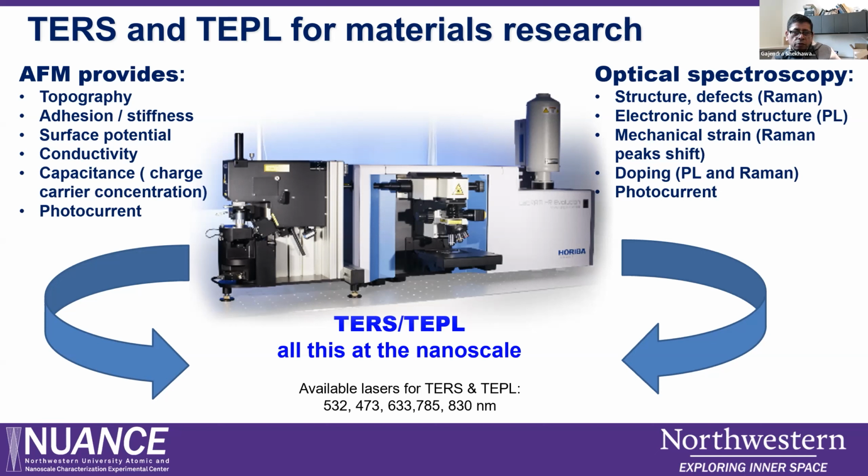So you can do conventional Raman spectroscopy. It has edge filters, so it also has notch filters. Notch filters will allow you to do both Stokes and anti-Stokes. If you know the Stokes and anti-Stokes, the ratio of these two spectra will give information about nanoscale thermometry, basically charge transport at the nanoscale.